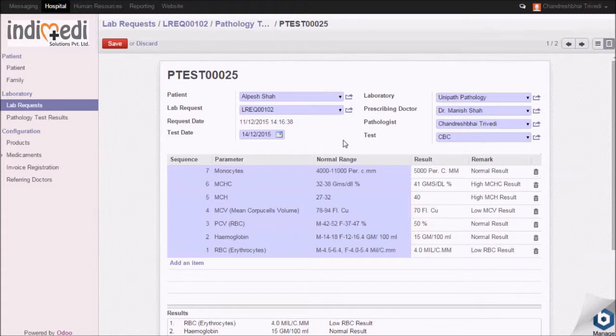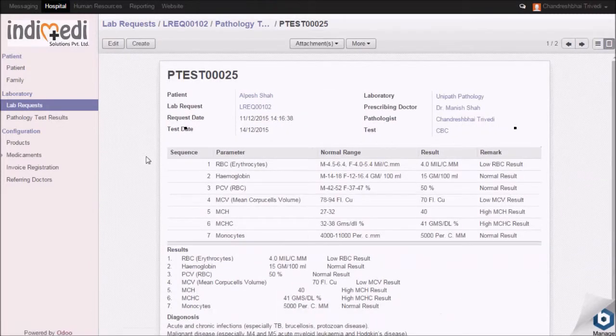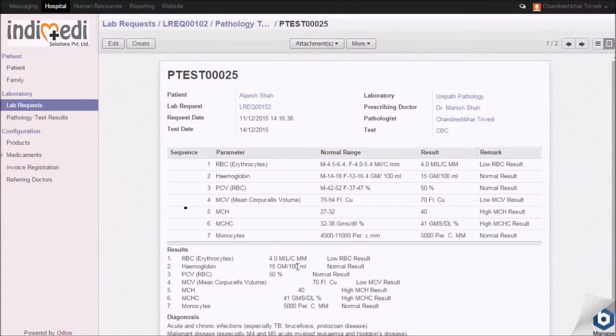Once done, click on save. All the details are now saved in the system.